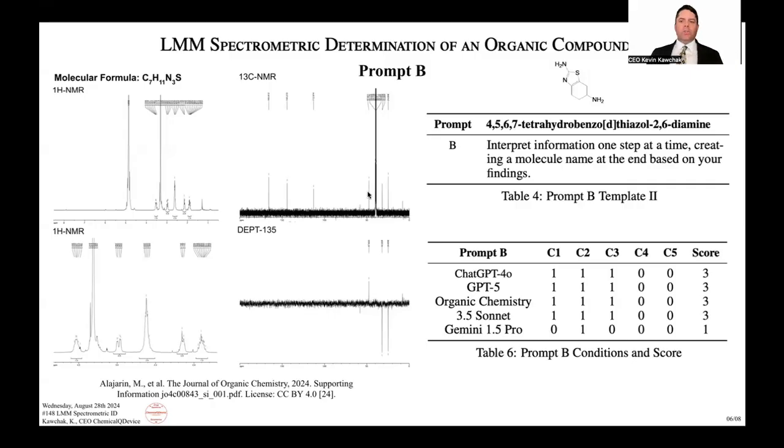And as far as getting a close answer, I wouldn't say that was the case. Although some of them did, and it's in the manuscript too, as far as taking this further in depth.